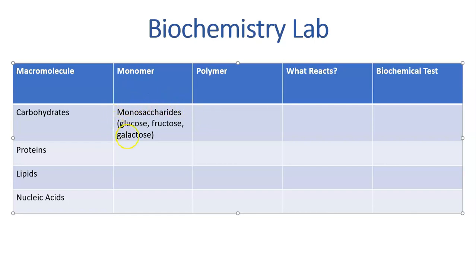So the thing that we're going to be testing for in our monosaccharide experiment is specifically these single ones where you have monosaccharides by themselves. All right, in these, there are lots of free OH groups or lots of free hydroxyl groups, and these free OH groups are very reactive in the particular biochemical test that we're going to do here, which is Benedict's test. So as you complete this test, you'll add the Benedict's reagent, you'll heat the sample, and then if there are monosaccharides present, you'll get a result from that.